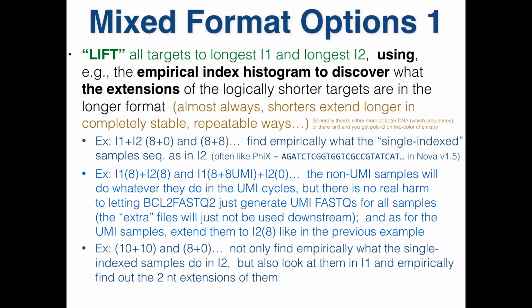I mean, these mixes of this format, I wouldn't recommend them, but they happen because, whatever, people have problems. Yeah, so I wouldn't recommend mixed formats in general, but once you're in mixed formats, if the UMI is involved, you should check that. If I throw away the UMI bases for a lot of my non-UMI guys, do I still have enough uniqueness to keep up? Assuming you do, then that's simply what you do.